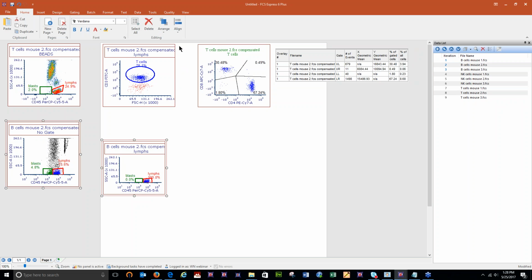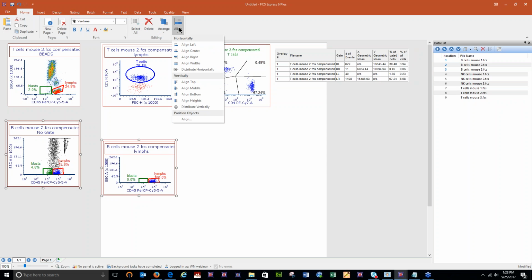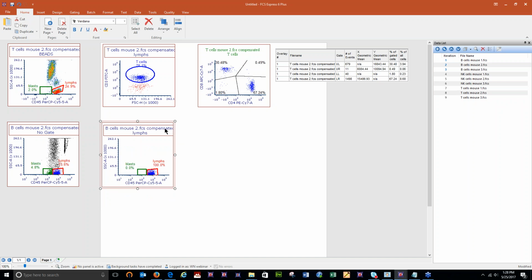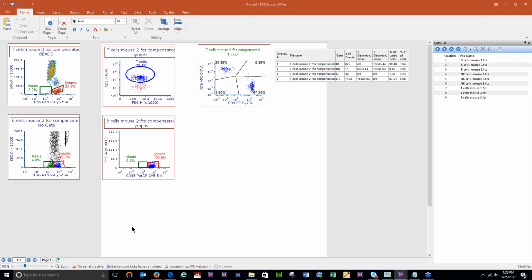So I know I'm showing you a lot of things, and it's kind of on purpose. This layout is a very typical layout that is similar to one you might be building in a lot of cases. So you're going to need to use many different tools in FCS Express. I'm just sort of trying to cover a lot of various things.